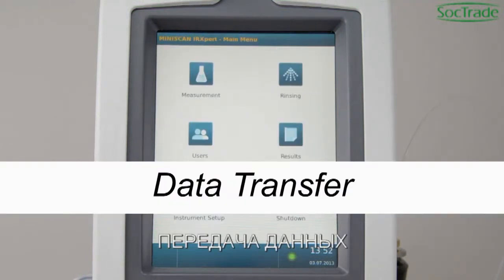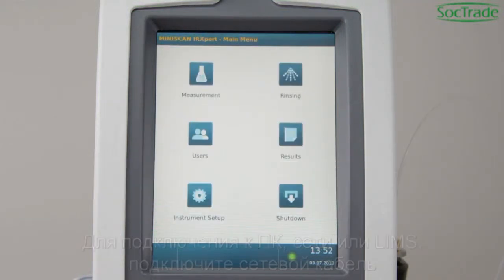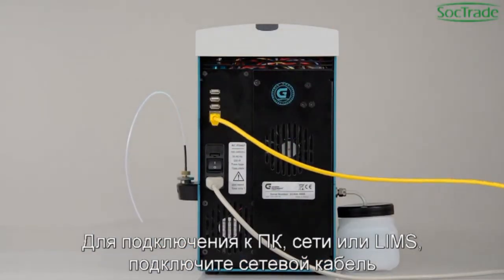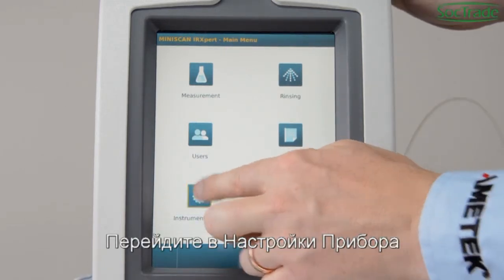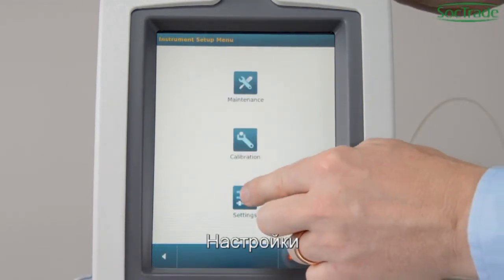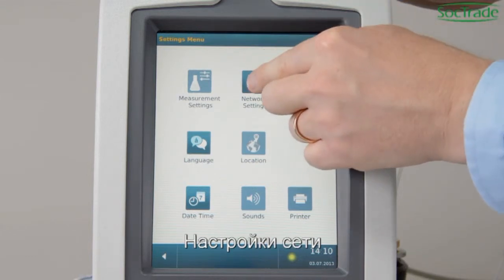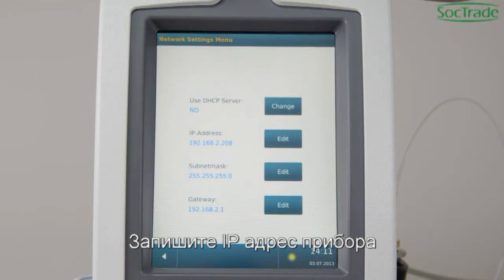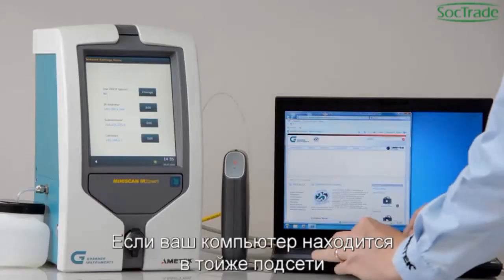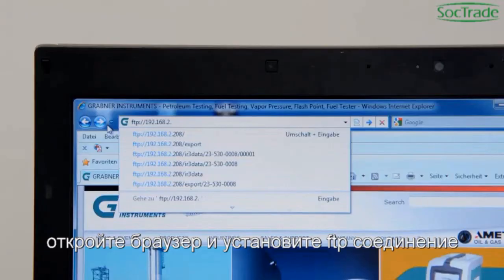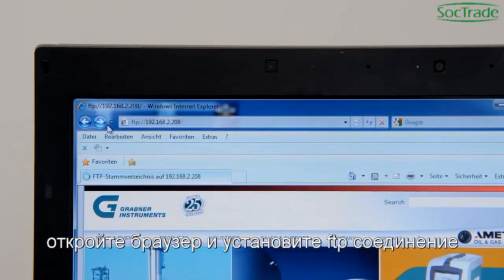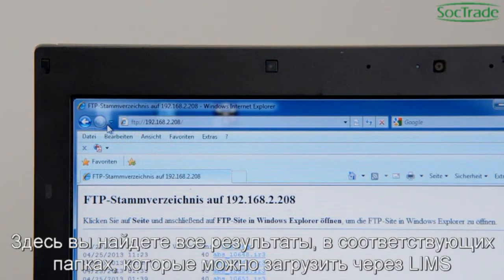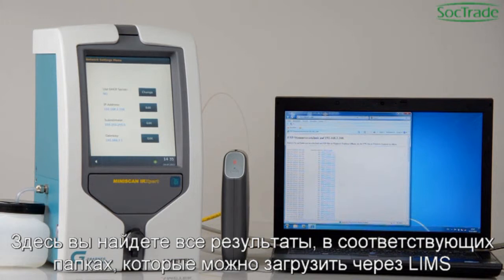Data Transfer. To connect a PC, a network, or to LIMS, connect an Ethernet cable. Go to Instrument Setup, select Settings and Network Settings. Note down the IP address. If your computer is in the same subnet, open a browser and establish an FTP connection. Here you will find all results in designated folders, which can be downloaded through a LIMS.